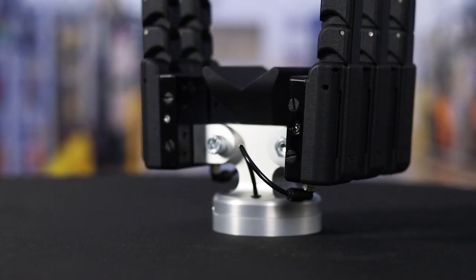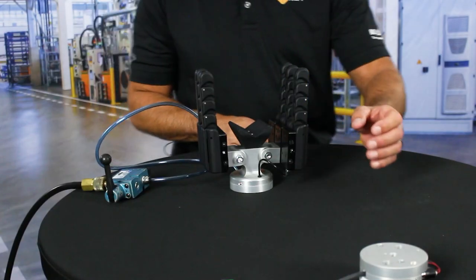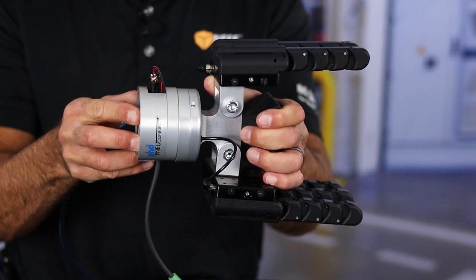Each finger can be equipped with up to two switches to sense positions such as part gripped, missed part, or starting position. The configured system allows ISO 9409 mounting standards to mount directly to most robots on the market. For universal robots users, the PHD NuConnect product can be used for a compact and convenient valve solution.